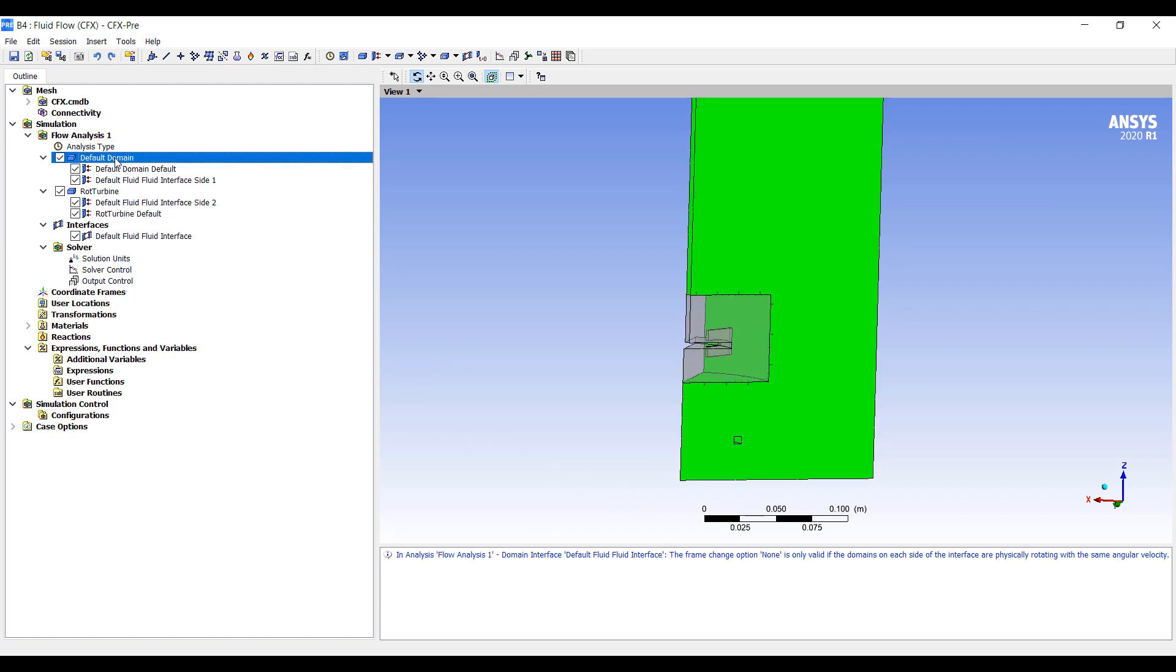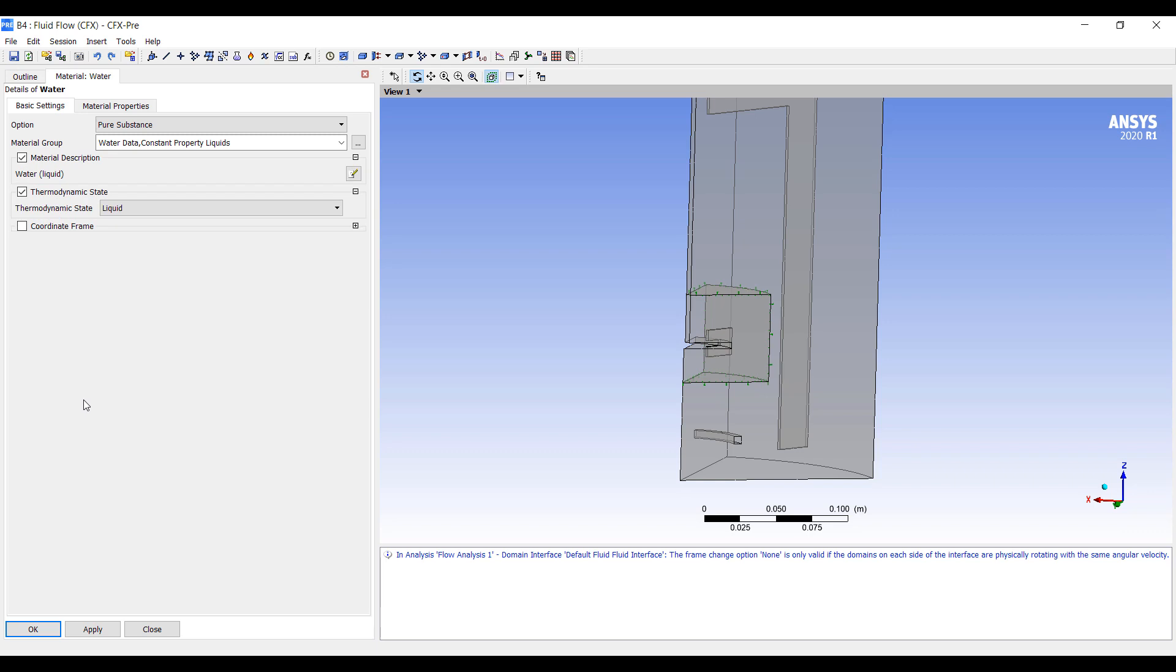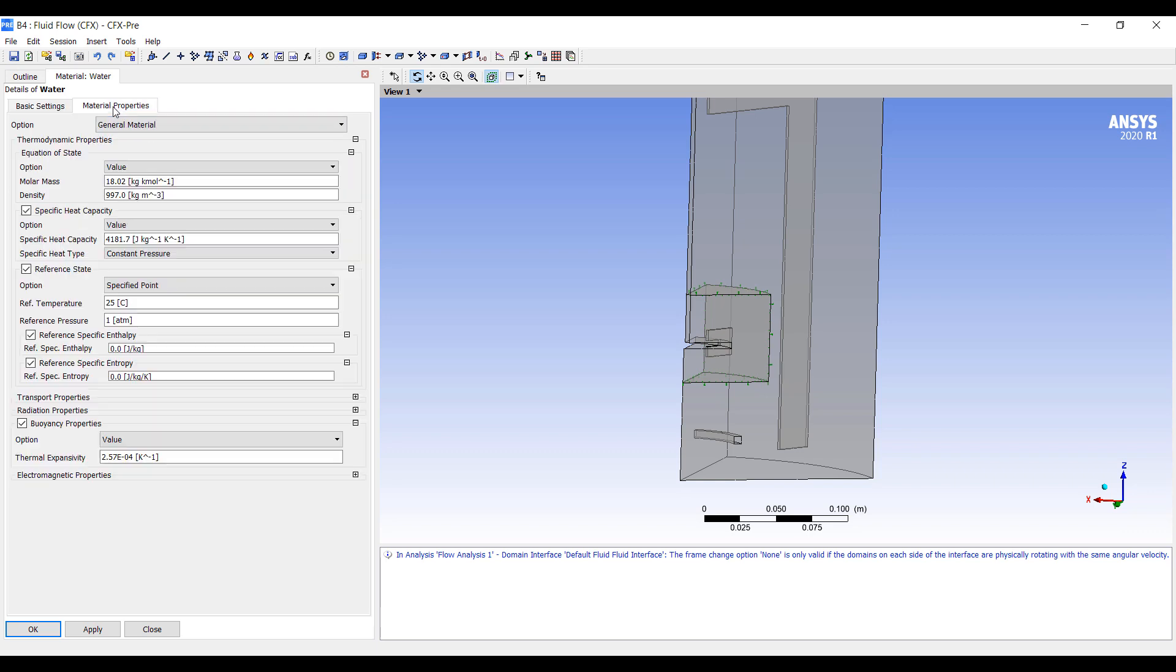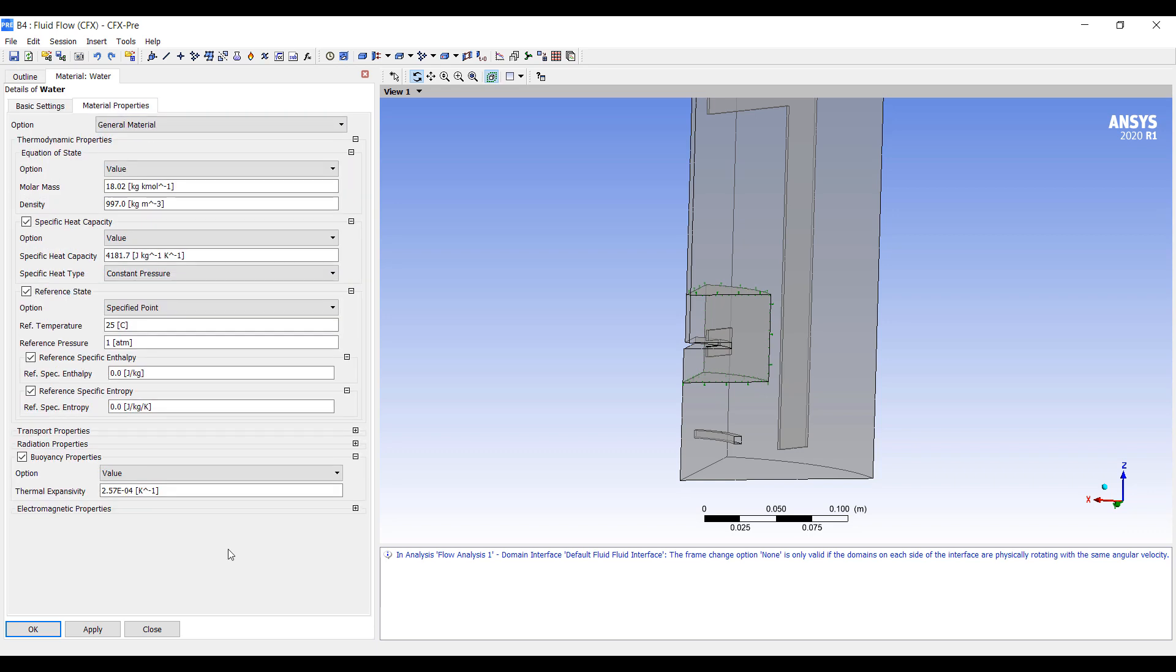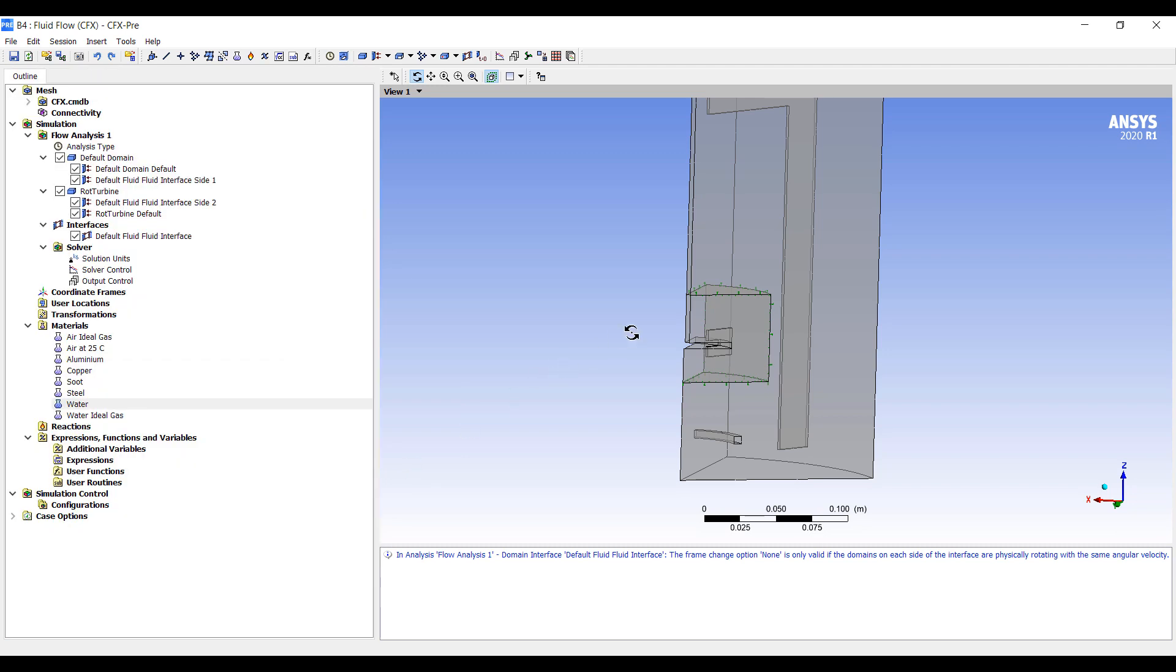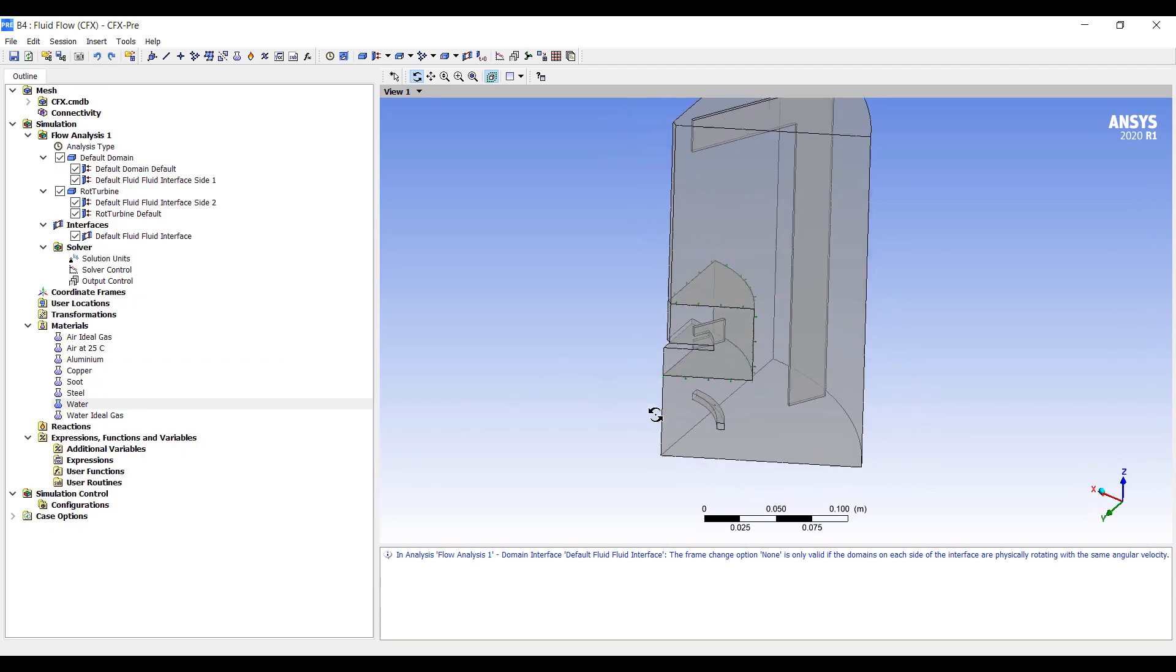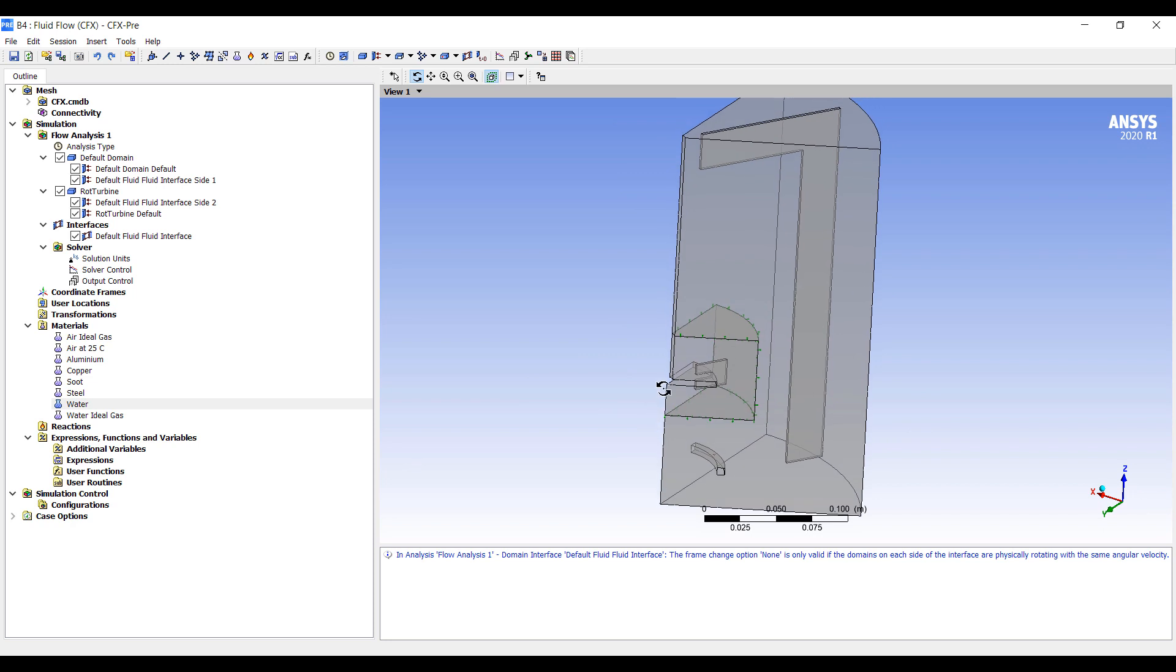Then we want to specify, so right now it's water. We can obviously specify different materials. Some of the key things our customers typically want to adjust is the dynamic viscosity. Right now we have the viscosity of water. Other bioprocessing materials could be a hundred times more viscous, a thousand times more viscous. We can also create, use an expression to create a non-Newtonian fluid, and have the viscosity become a function of the shear rate.